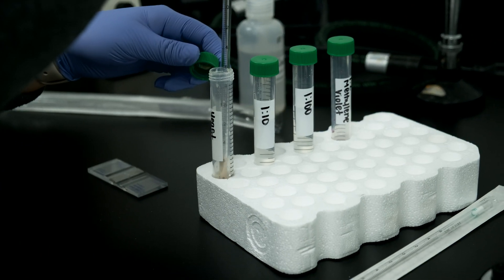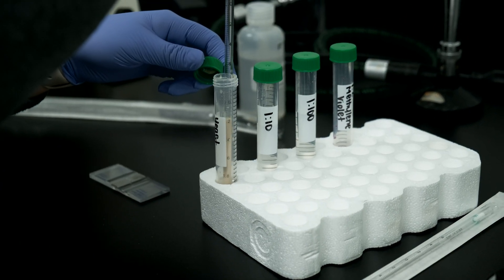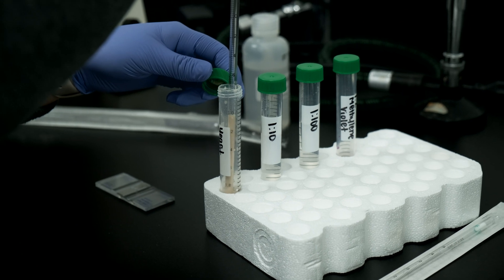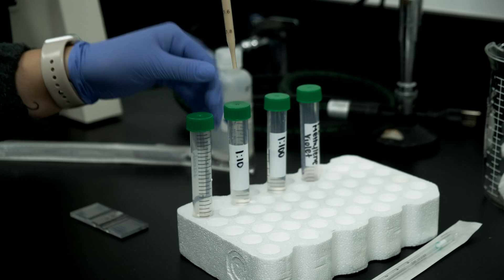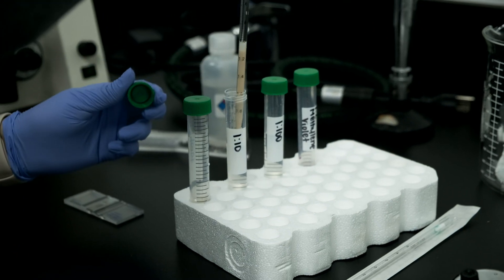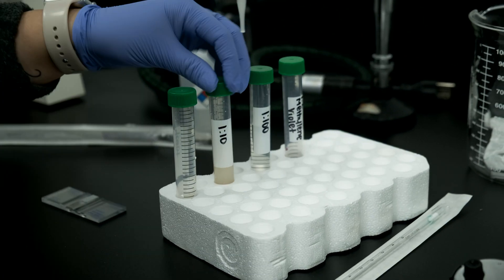First, we need to dilute the concentrated yeast slurry down to a 1 to 100 dilution. Begin by homogenizing your samples and then transferring 1 milliliter of yeast slurry into 9 milliliters of water. This will create a 1 to 10 dilution.